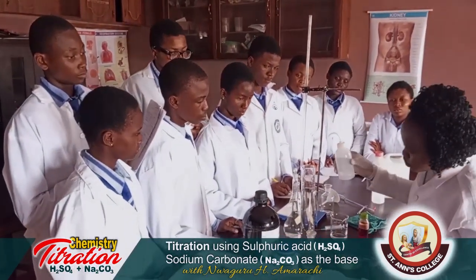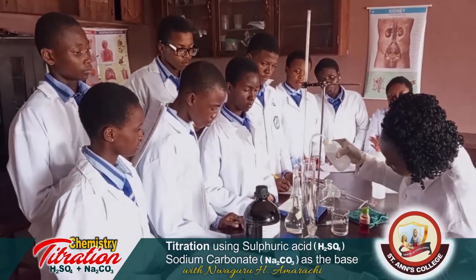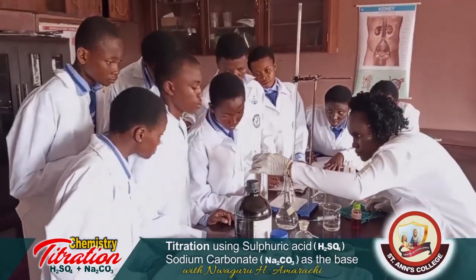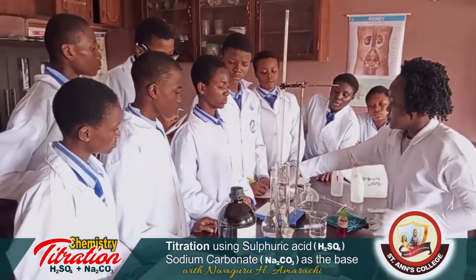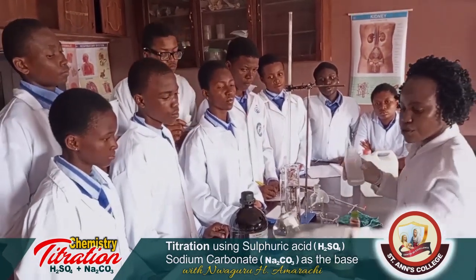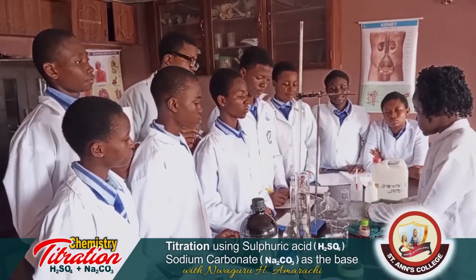Remember, you have to use your wash bottle to make it up to mark. Remember to rinse your glasswares with what? Distilled water.